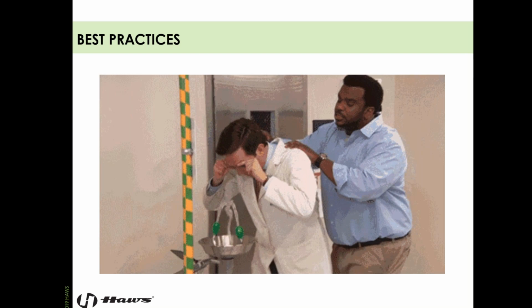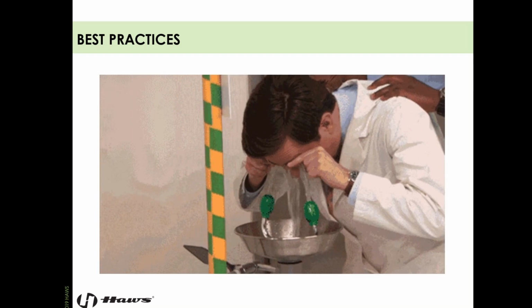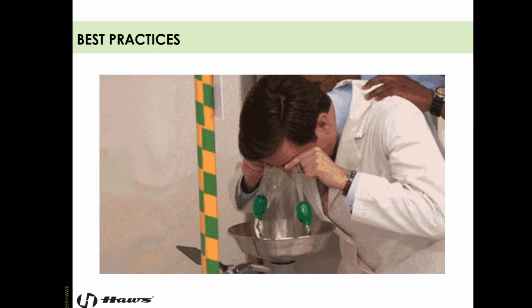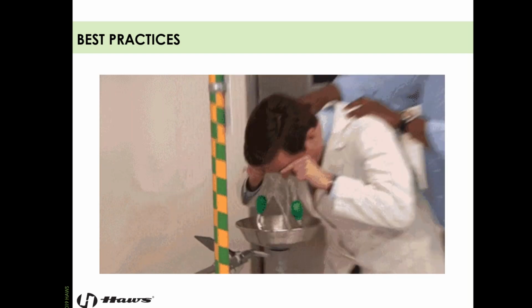his technique is ideal. What you want to do is, especially if it's a contaminant with just your eyes, use your fingers, grab your eyelids, and do not hold back. Open them as wide as possible and stick your eyes into the eye wash or eye face wash, okay?